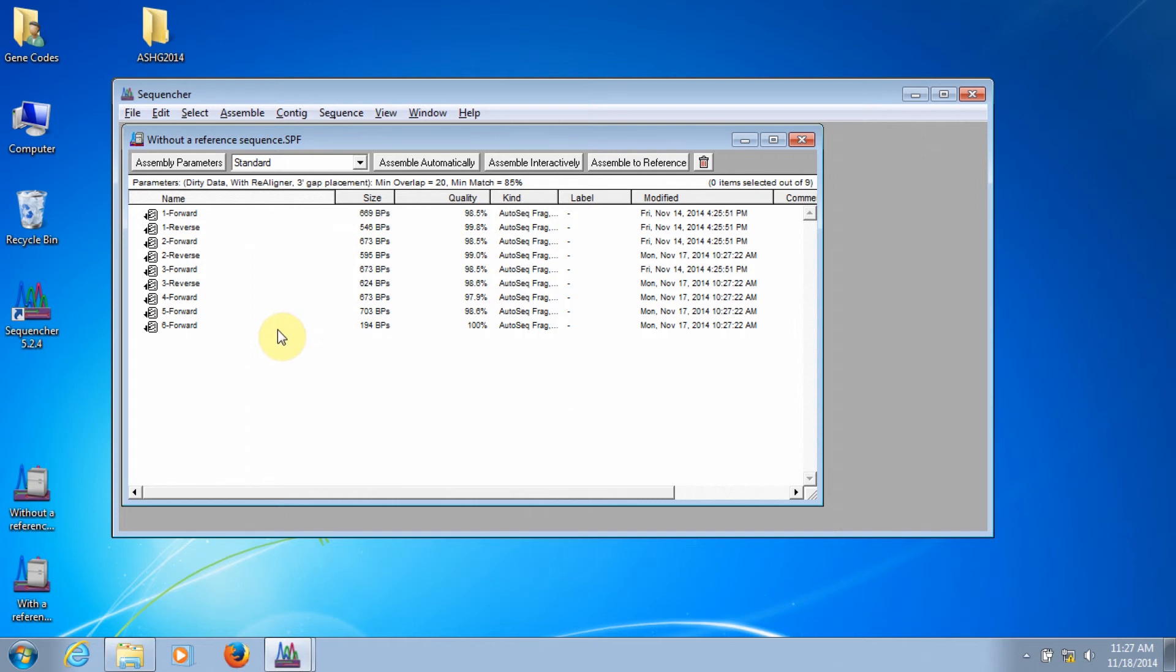In the project window here, I have some of our sample data. These sequences have already had the lower-quality reads trimmed off of their ends. You can learn how I did that in the Sequencher tour guide part 2 video.